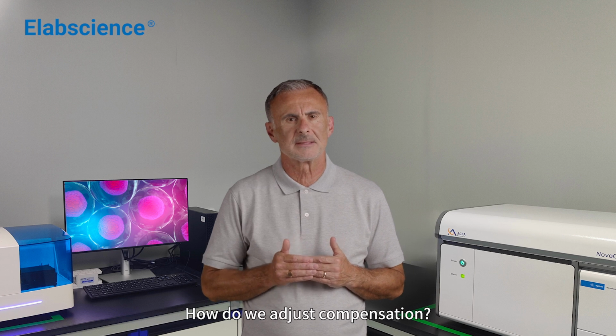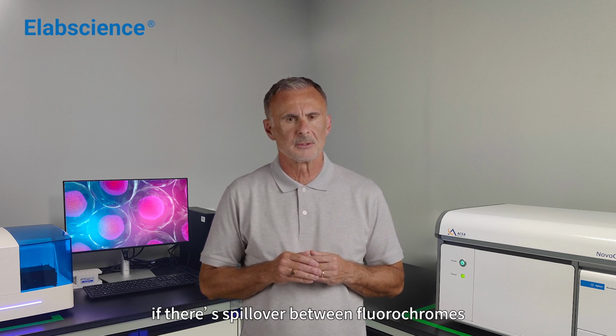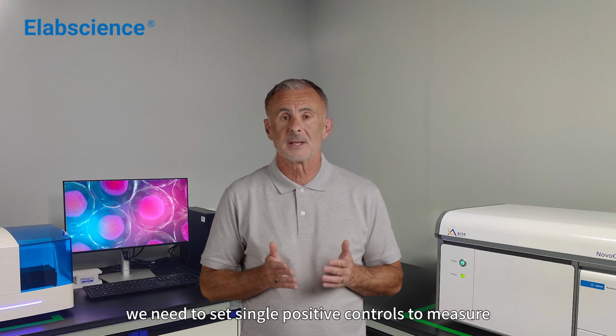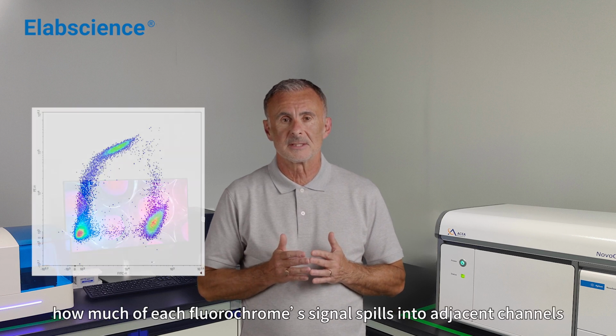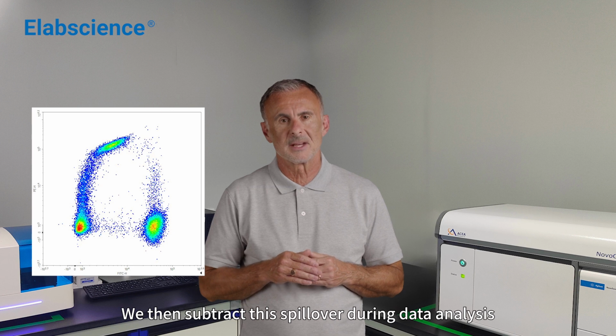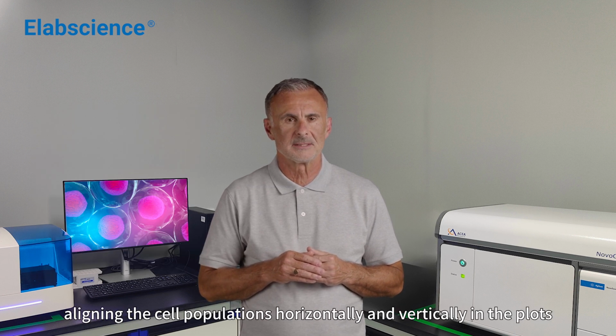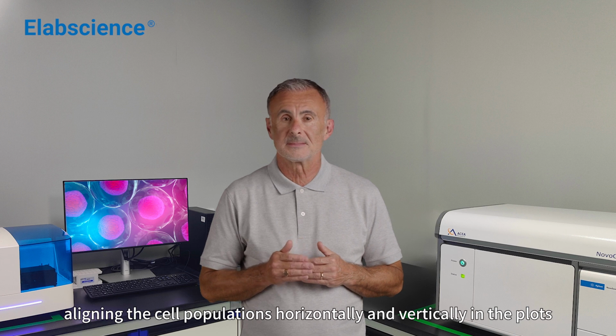How do we adjust compensation? When performing experiments, if there's spillover between fluorochromes, we need to set single positive controls to measure how much of each fluorochrome signal spills into adjacent channels. We then subtract this spillover during data analysis, aligning the cell populations horizontally and vertically in the plots.